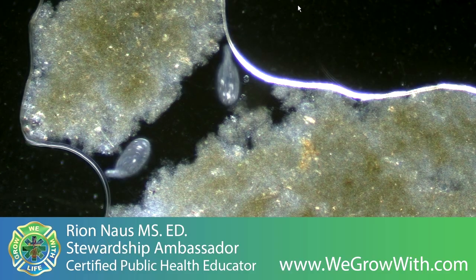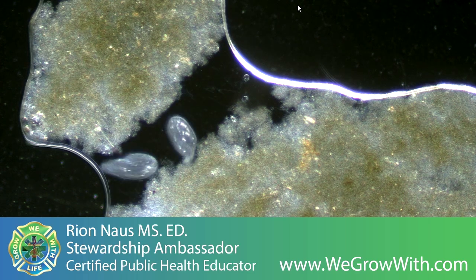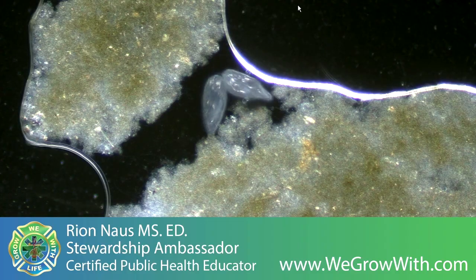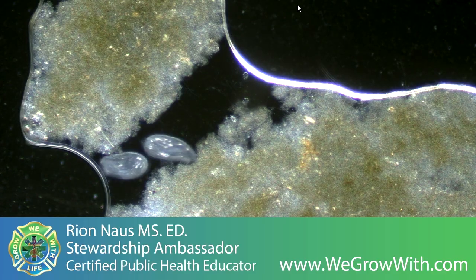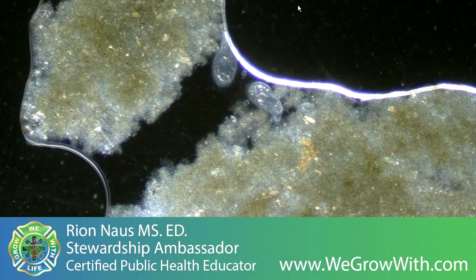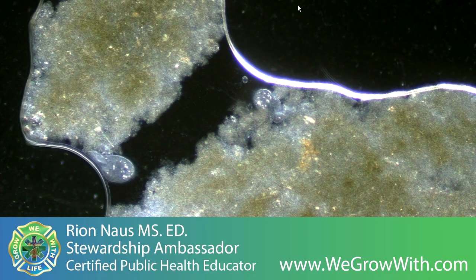It has a frantic feel to it. And I would assume that people would anthropomorphize and say something like fear. But there's also part of me that just thinks that it's doing exactly what it would be doing if all the water was there. We just see it condensed. I think it's these other cues that cause the instinct to respond. Oh, let it go. You can do it. Come on. It's not over there. Keep going.